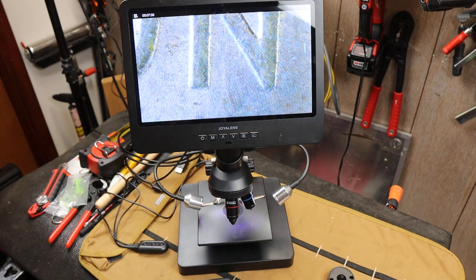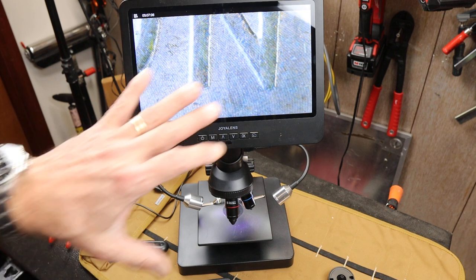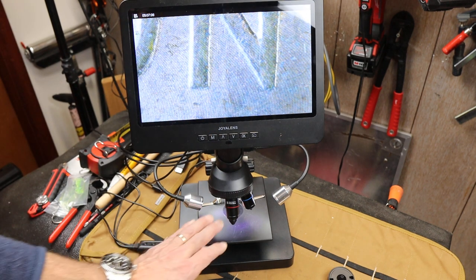I mean, that is truly amazing. I'm stunned actually at how sharp this is, it's just fun to use.